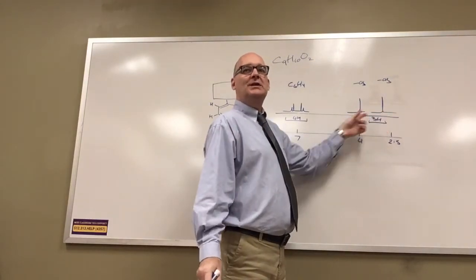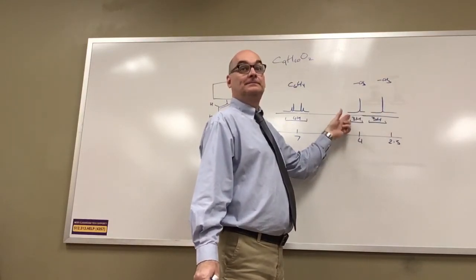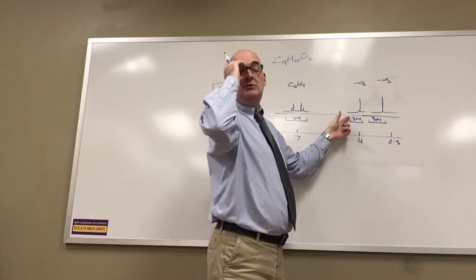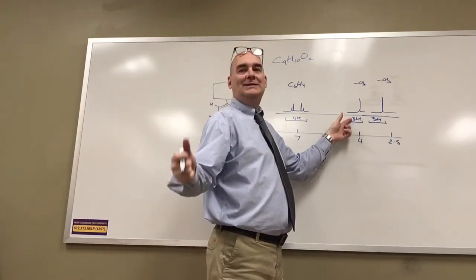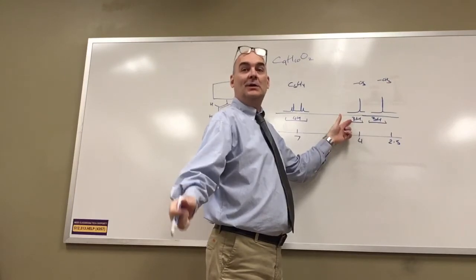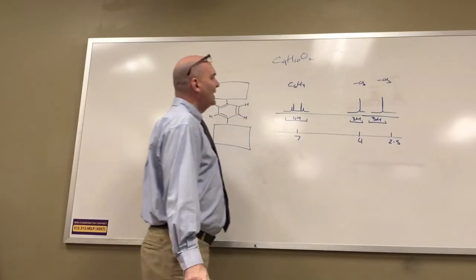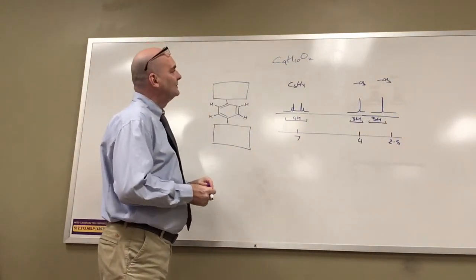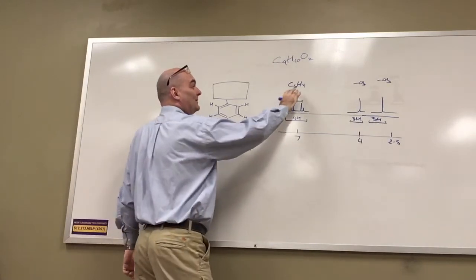which one's nearest electron withdrawal? Severe electron withdrawal is more likely to be because you are directly attached to an electronegative atom. Are there any electronegative atoms in my formula? I got 2 oxygens. All right, so let's piece this together.